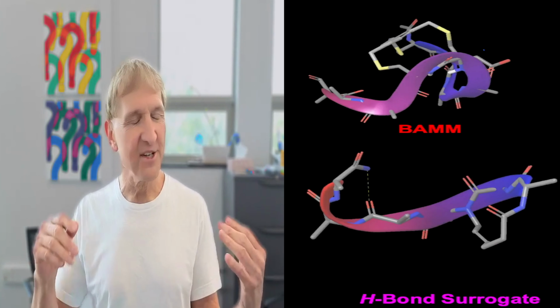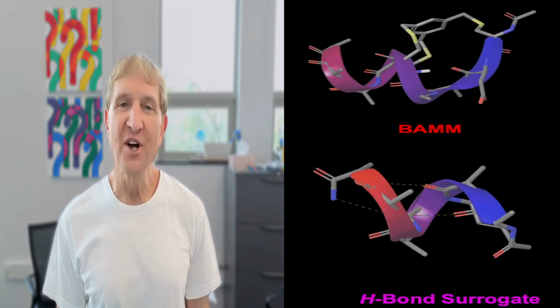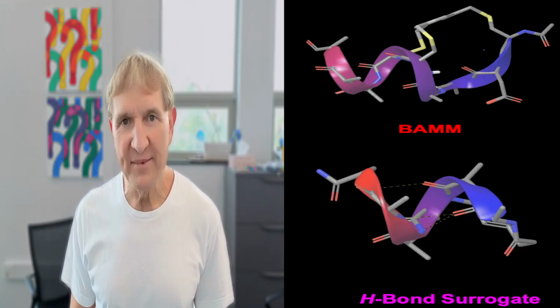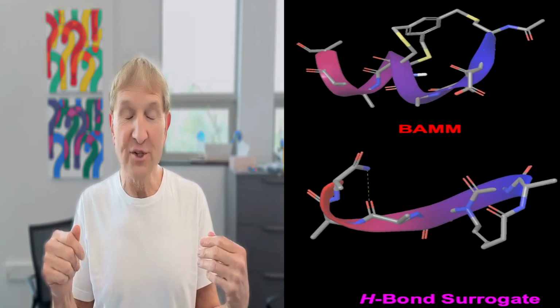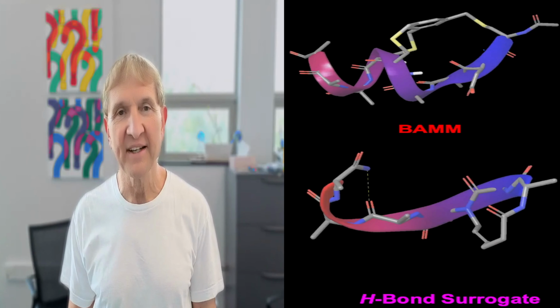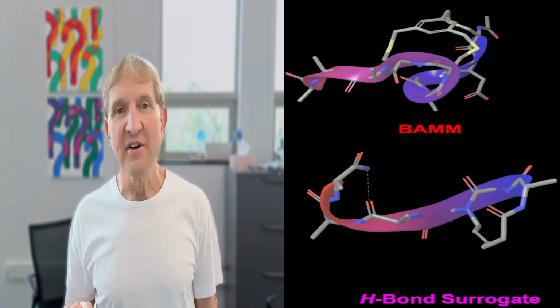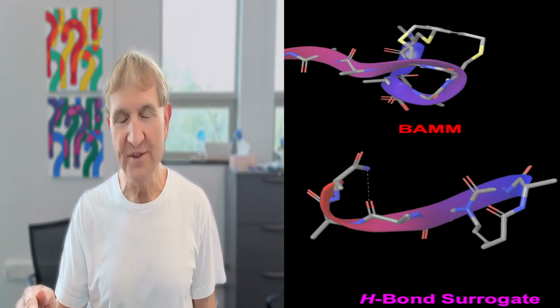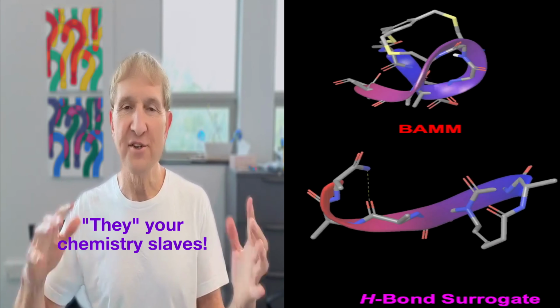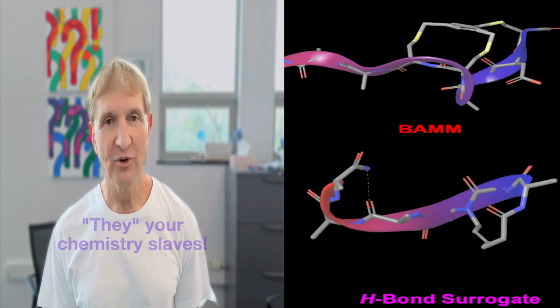Peptide synthesis is beautiful. If you're a life science major, it's good to know that you can make peptides in this way, but more often, if you're doing research or you're working for a biotech company, you just go to a service provider and ask them, please, make me this sequence, and they will make it by solid phase peptide synthesis and then HPLC purification.